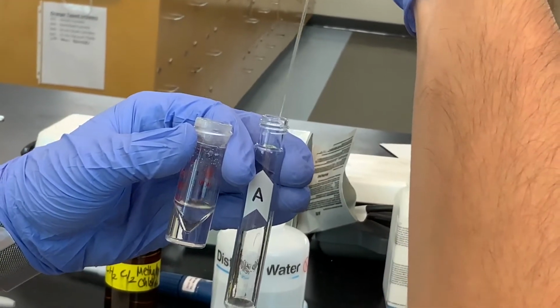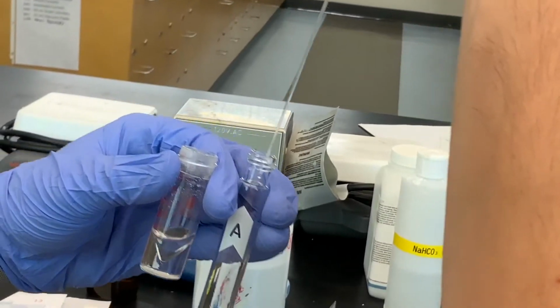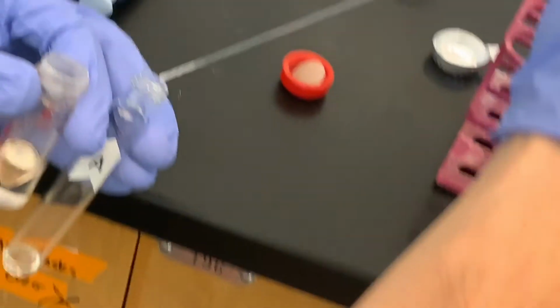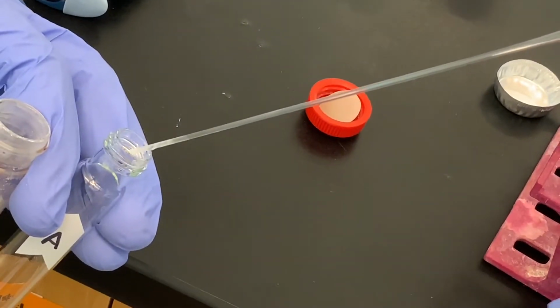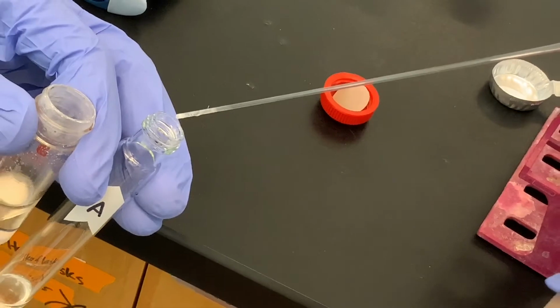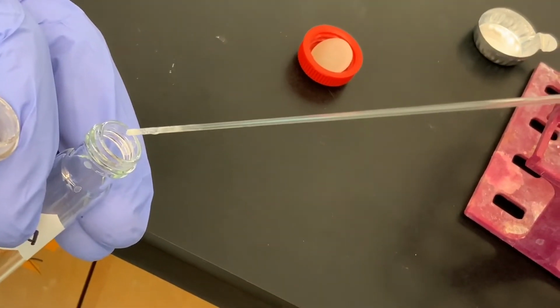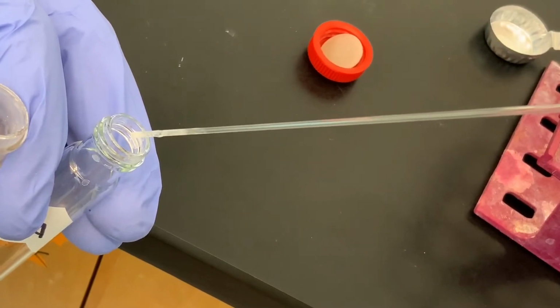So the issue here, which is why I was trying to draw up a little bit more and made a mistake, is that if we look at the end of the Pasteur pipette, the methylene chloride that it saw evaporated and left some benzoic acid on it. You can see on that tip there. And so that is absolutely a source of error.